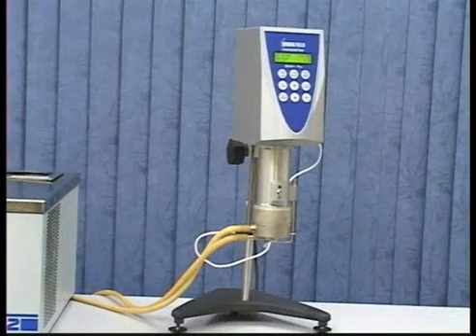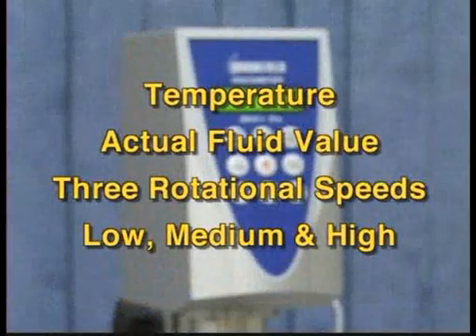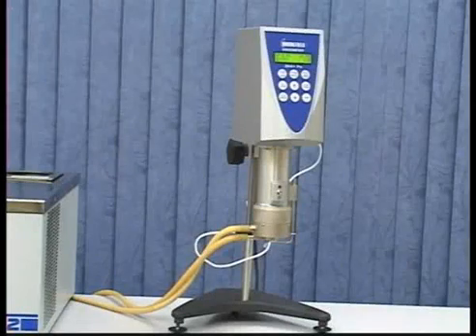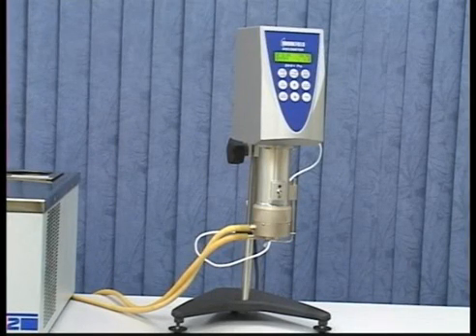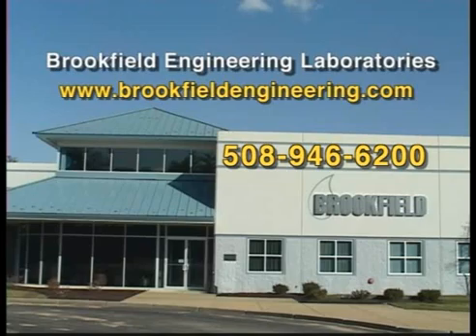And that's it — you have performed a cone plate calibration check. Remember the important aspects: good temperature control, use the actual fluid value for the viscosity standard at 25 degrees Celsius, and select three rotational speeds based on the associated viscosity ranges that provide low, medium, and high torque readings. If you find the instrument is not within tolerance after performing a calibration check, repeat the test to ensure everything was done correctly. If your instrument is still not within tolerance, contact Brookfield Engineering or an authorized dealer.